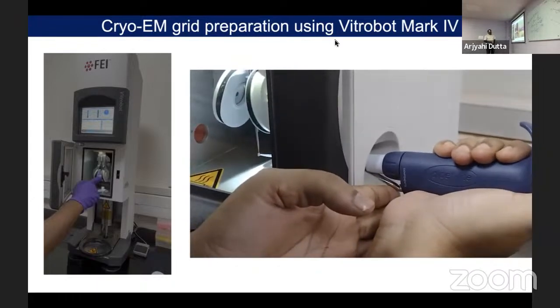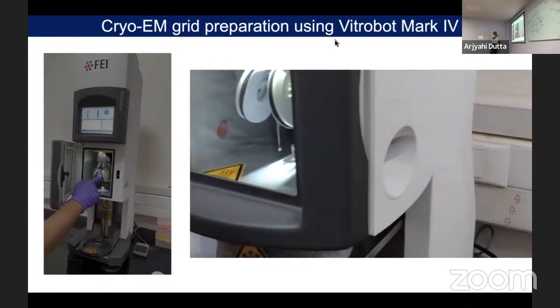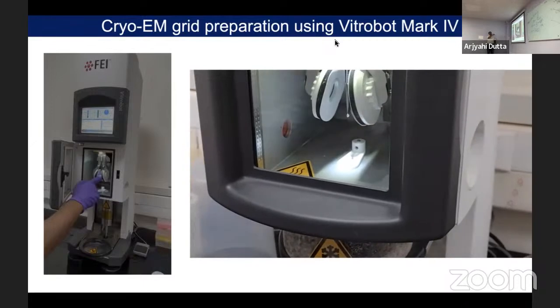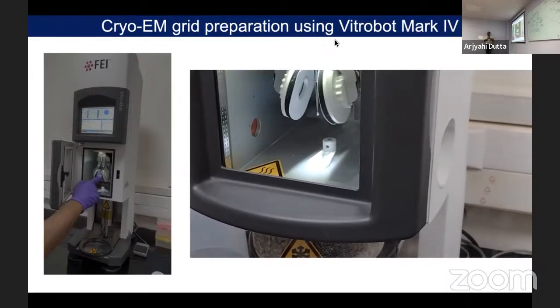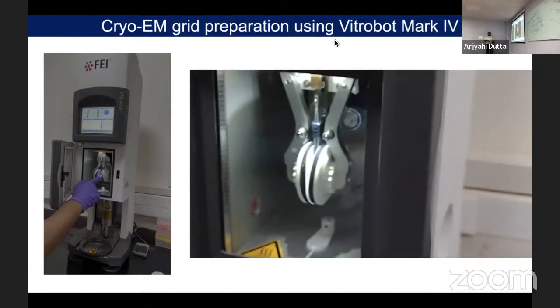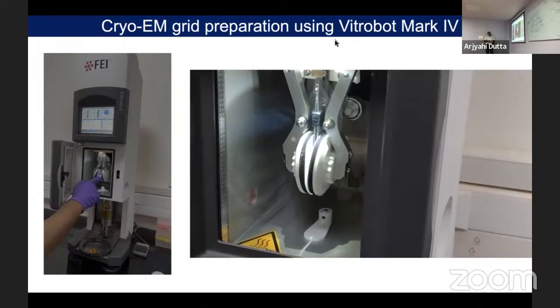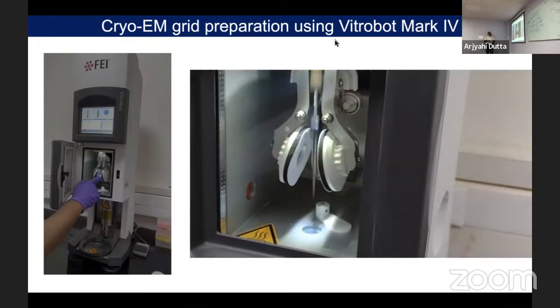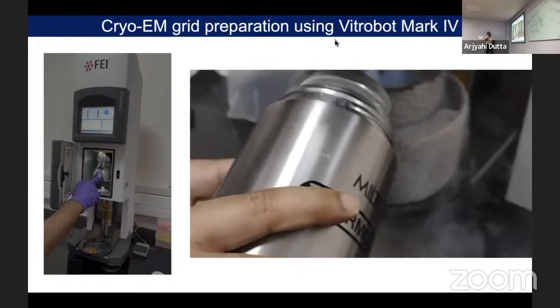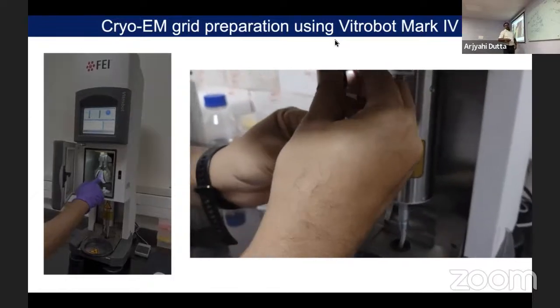I'll skip a couple of slides. So we are adding the sample here. Then using this blot paper, this entire thing happens automatically. Here we are doing nothing. The filter paper will blot. How much blot time and how much blot force, we have to decide at the beginning, and then we freeze the sample. So you will get a frozen grid. When we have this frozen grid, we transfer it to the microscope for imaging.